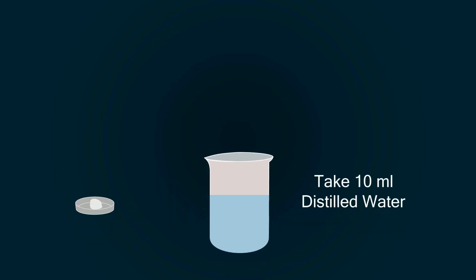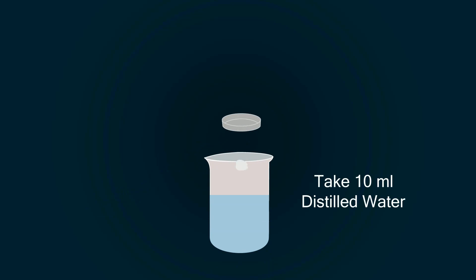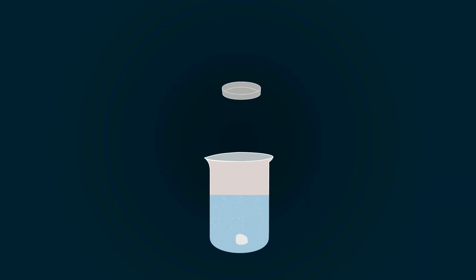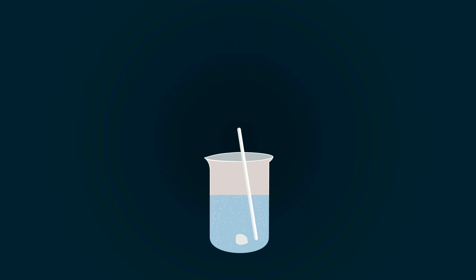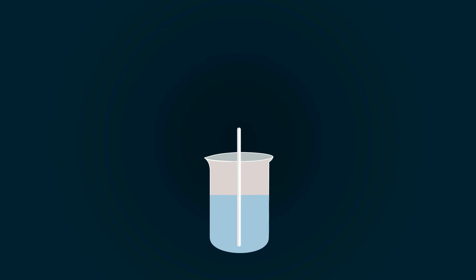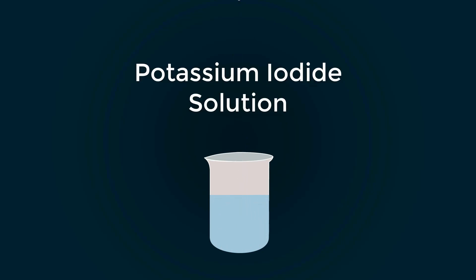Now take 10 milliliters distilled water into a beaker. Put potassium iodide into it. Dissolve potassium iodide with help of glass stirrer. Potassium iodide solution is ready.